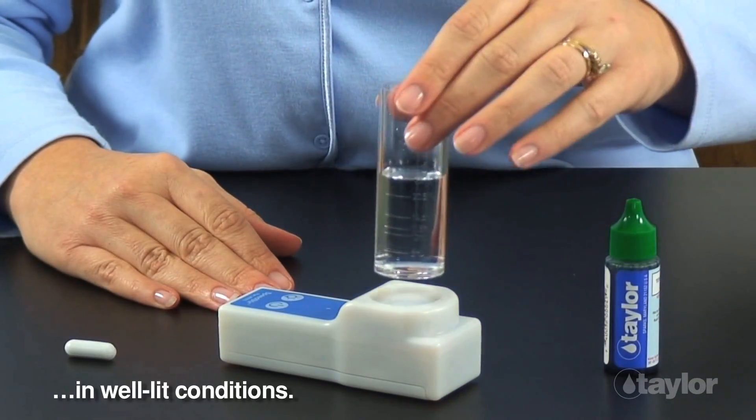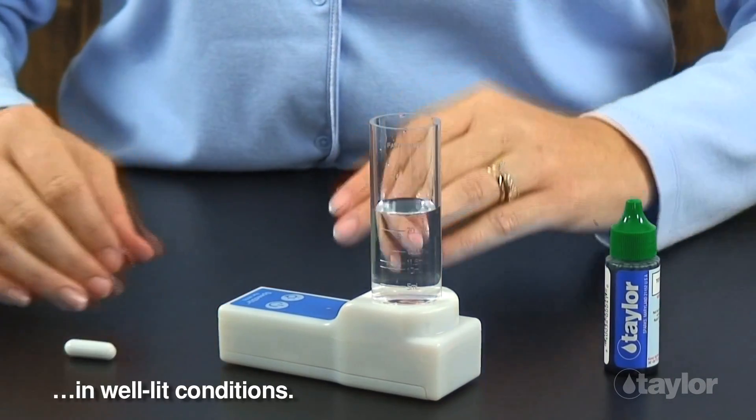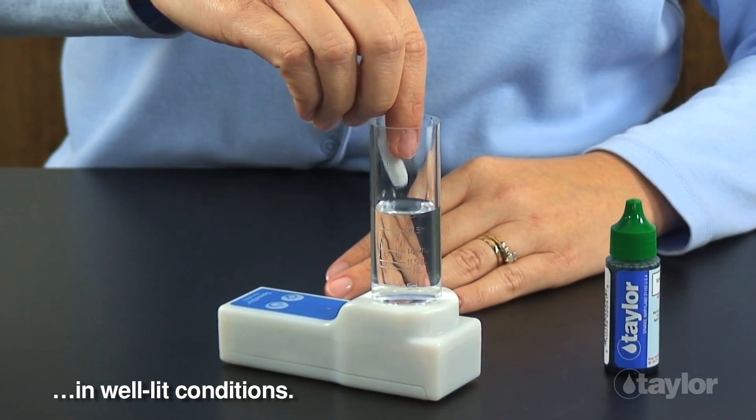Place the water sample on the mixing platform, then gently drop in a clean, dry, Teflon-coated stir bar.